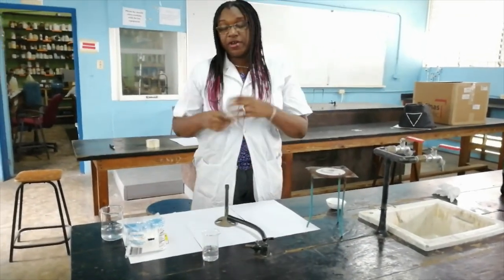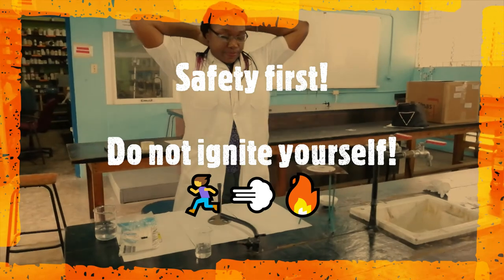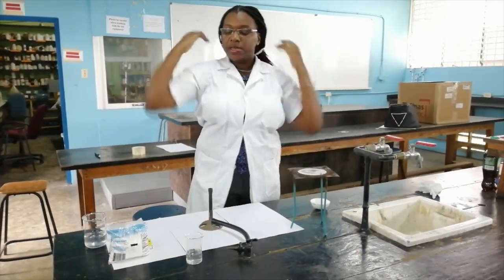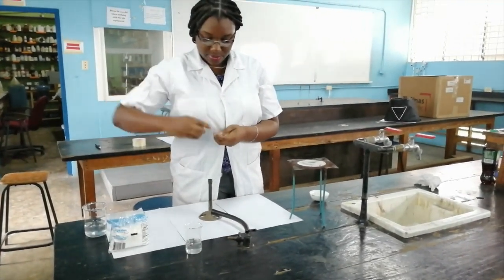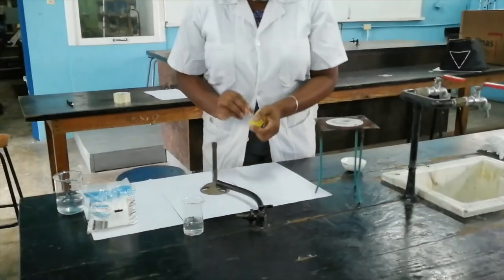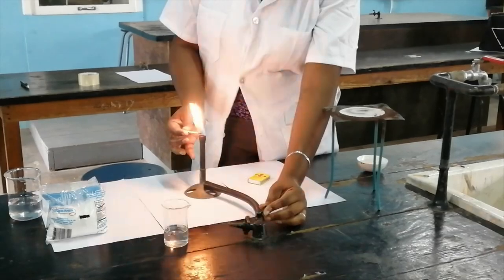Safety first — I do not want my hair to catch on fire, so I need to move all of this here so it doesn't hang in the flame. We have to ensure that the air hole is closed, and then we light the Bunsen burner.